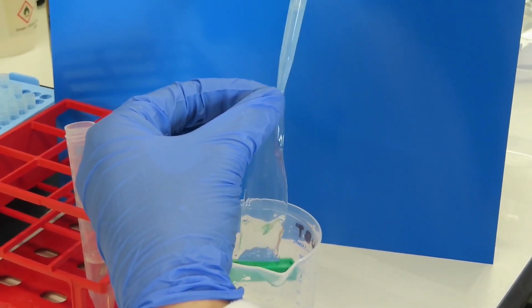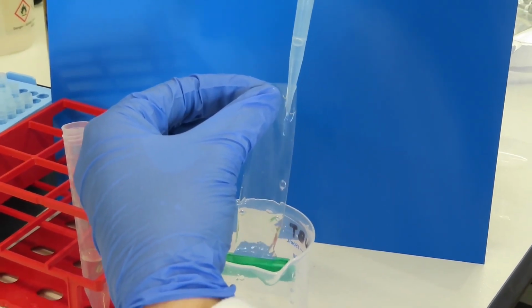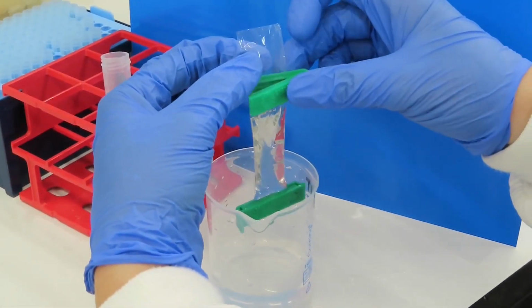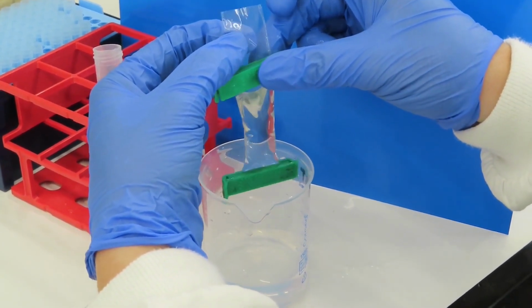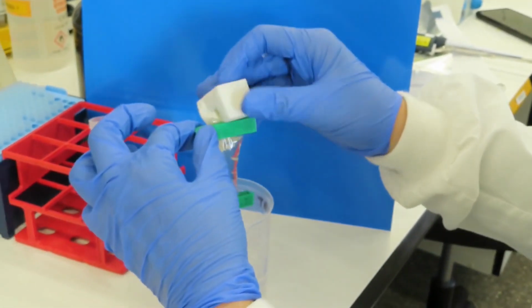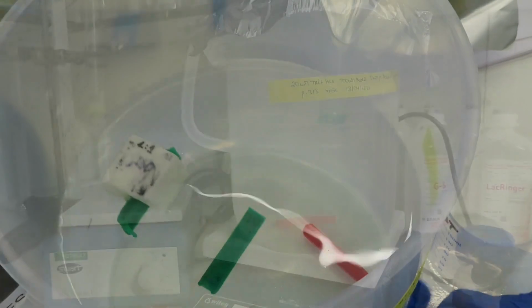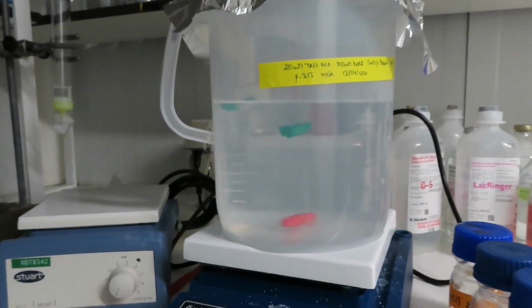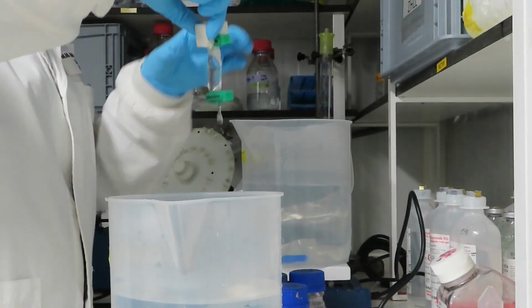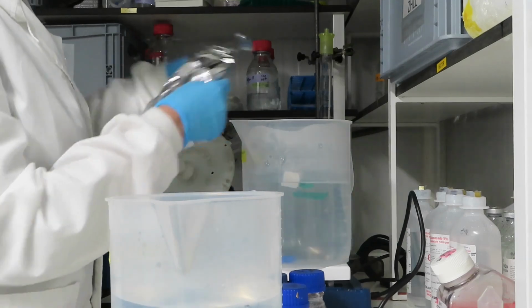Before the delivery of the protein or the next purification step, the protein pool must be dialyzed in order to remove the imidazole and to contain the protein in the buffer of the customer's choice. For this purpose, the sample is introduced in semi-permeable bags that are submerged in a high volume of the desired final buffer. To promote buffer exchange, the system is kept refrigerated under agitation during several hours, normally overnight, and the buffer is renewed several times.